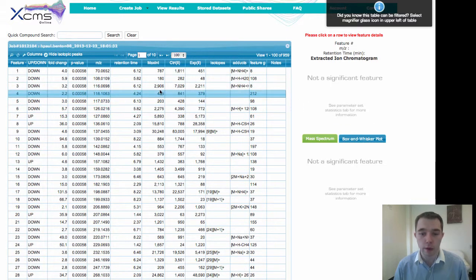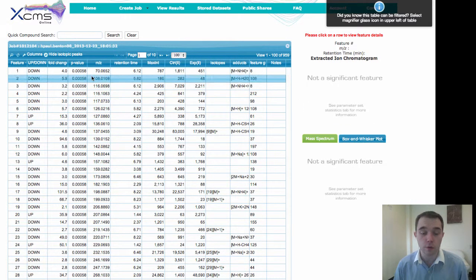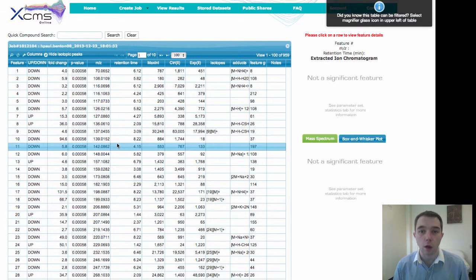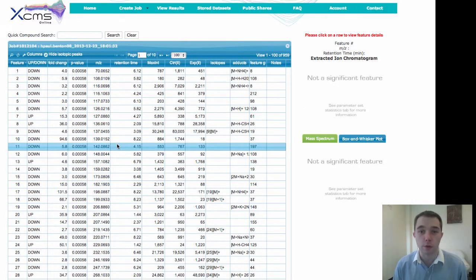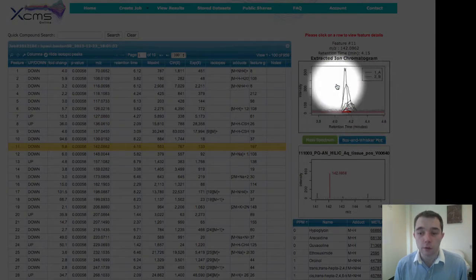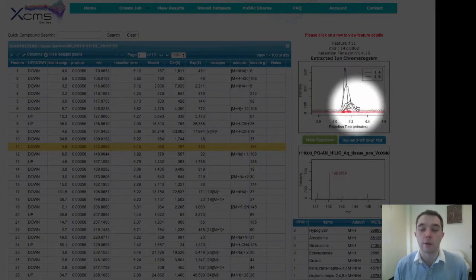If you click on browse results, you can see all of your different features which are already sitting here. Simply click on one of your features and you can see the extracted ion chromatogram.